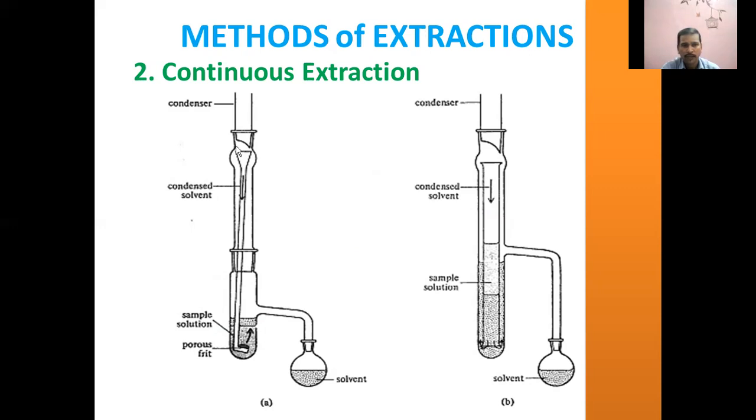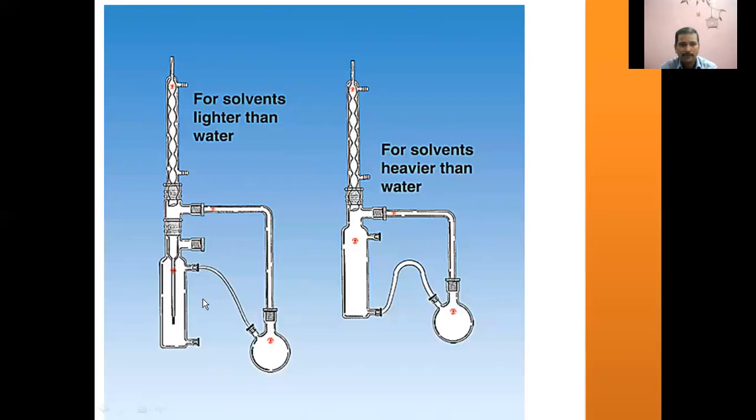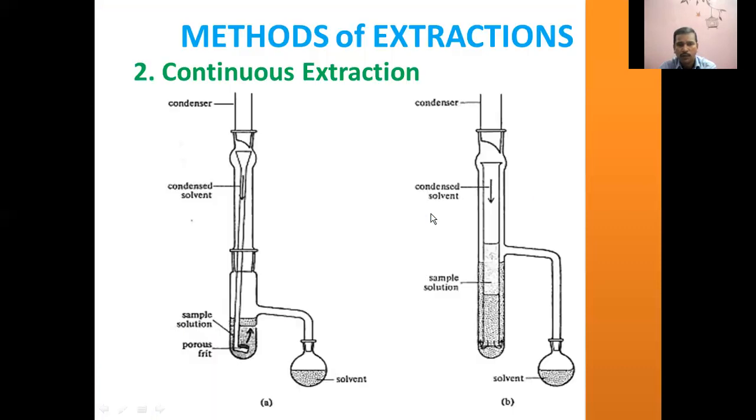Then the liquid will be collected into the funnel followed by this tube, where the vapors of the organic solvent will be coming up because they are lighter. So when compared to this, the previous equipment which I have shown is better. If the organic solvent is denser, this type of equipment will be used more commonly.